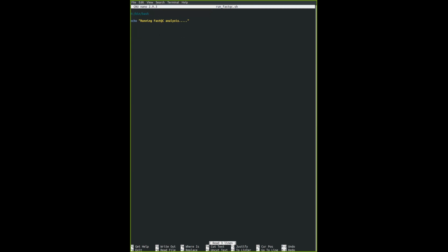One thing that you have to pay attention to when you're typing a script is where the script is in your working directory. Where exactly is this file, and where are your other FastQ files or other directories relative to your script folder?